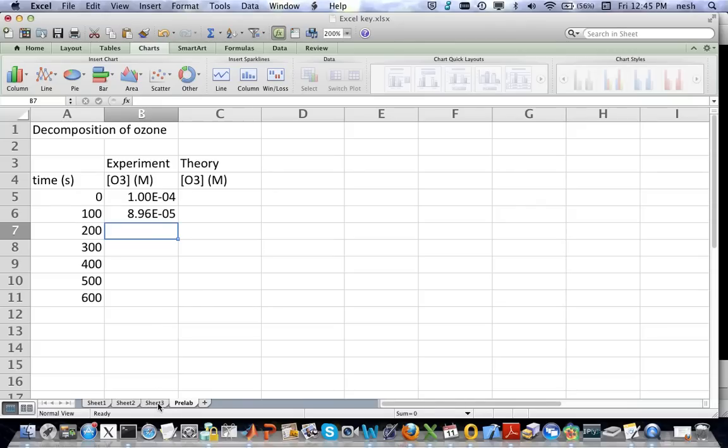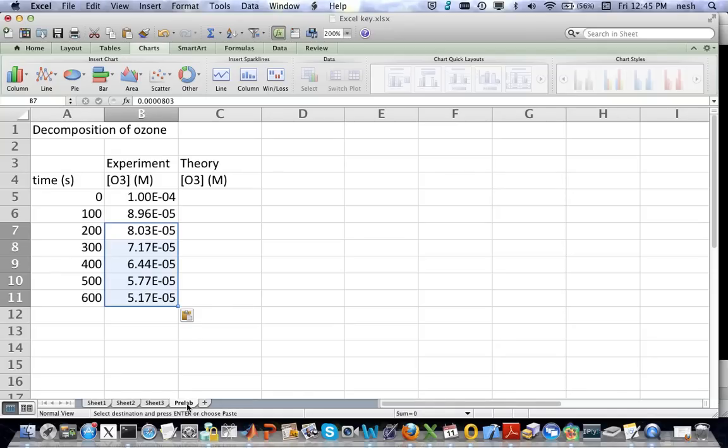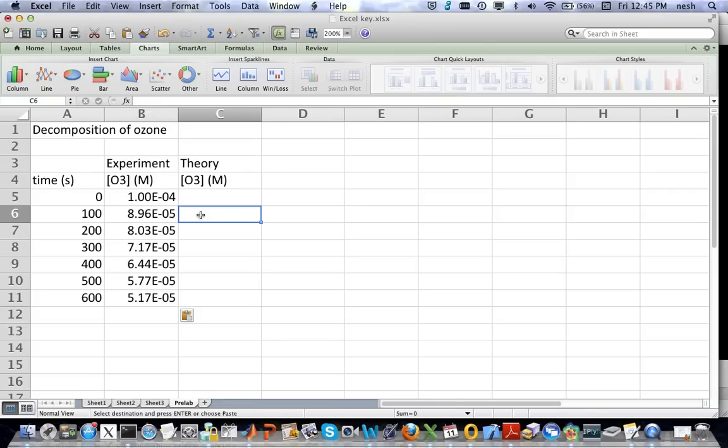Now I'm going to cheat a little bit because I've already typed in all these numbers somewhere else. So there we go. And you can do the same if you want, and go ahead and then pause and then come back.